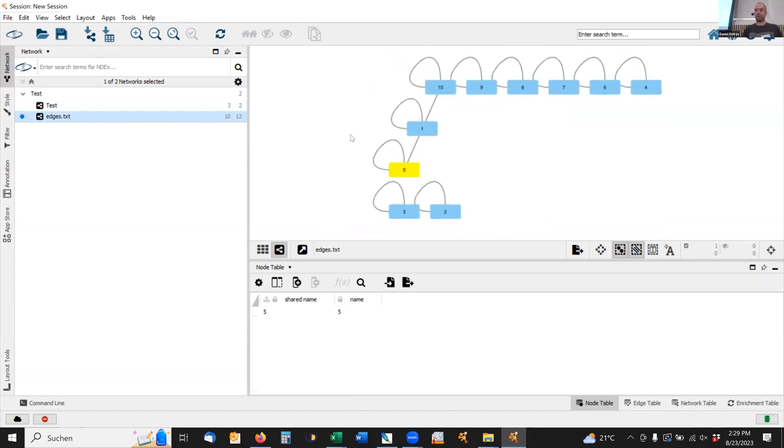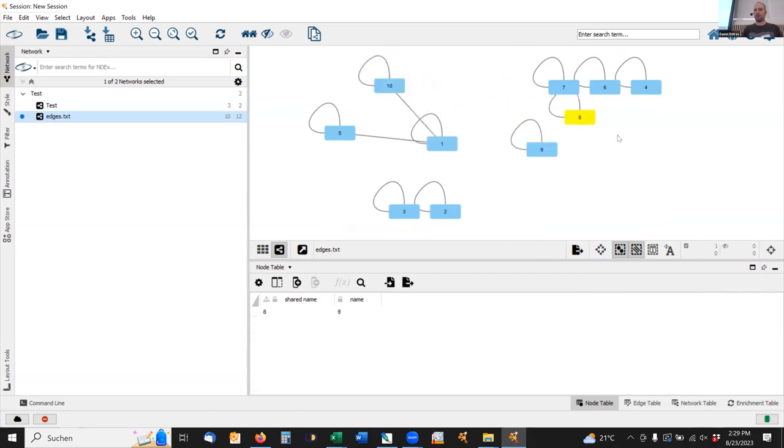Okay, and now, well, it's just numbers, so I don't really know what those things are. But now to these nodes, I can load in the other table, which gives me all this meta information about these nodes. And such meta information could be the outputs from SIRIUS. If those were IIN features, then I can load in the SIRIUS IDs as a layer. I can load in the library IDs as a layer.